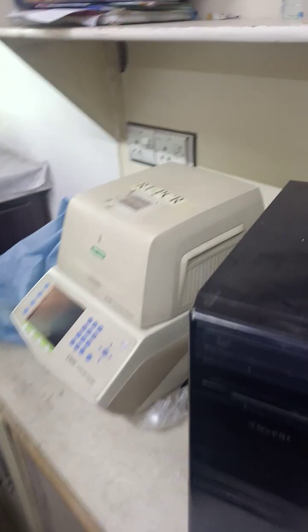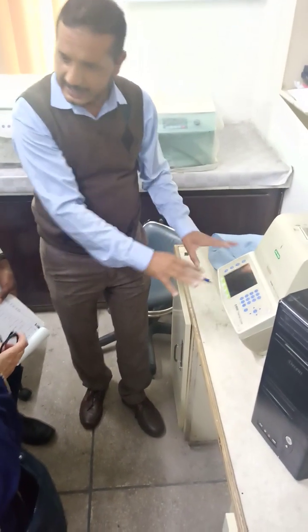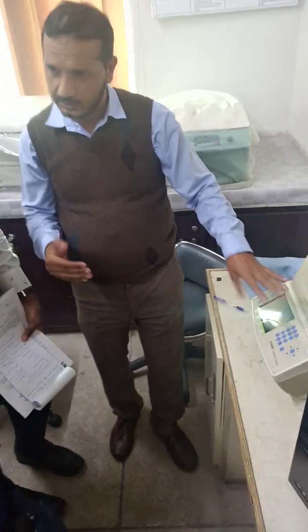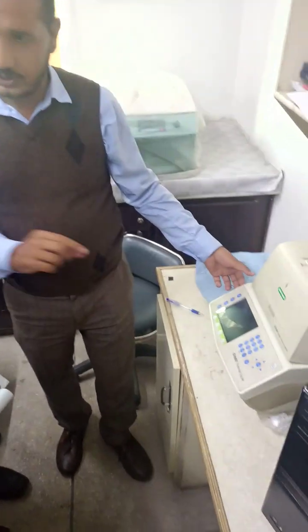The difference between conventional PCR and real-time PCR is that in real-time PCR there is a camera. The lower part is likewise the conventional PCR. Amplification is there. In conventional PCR it's the same. But in this case we use a fluorescent dye, and here is the camera. That camera detects the presence of the fluorescent dye.